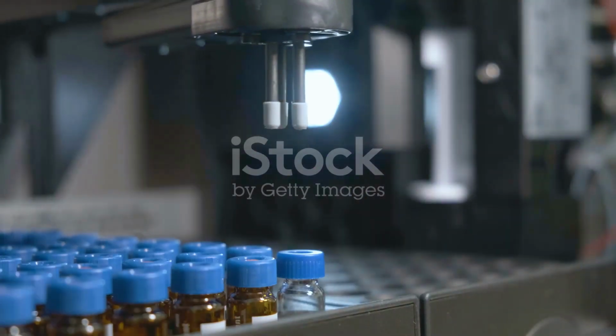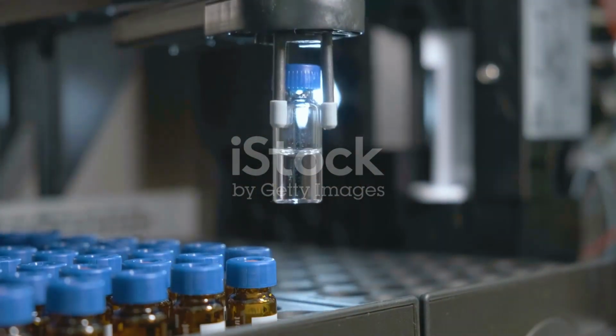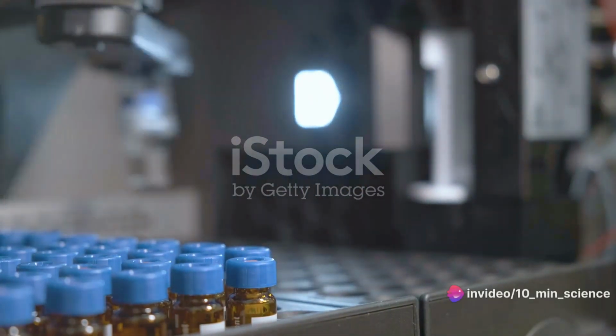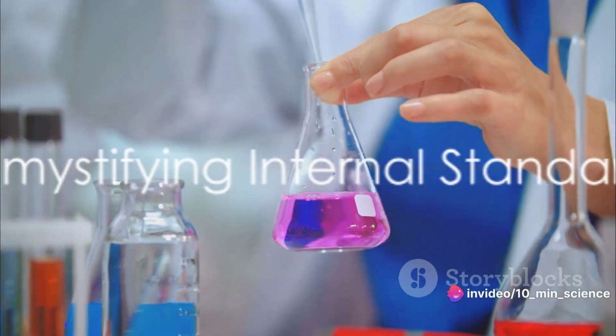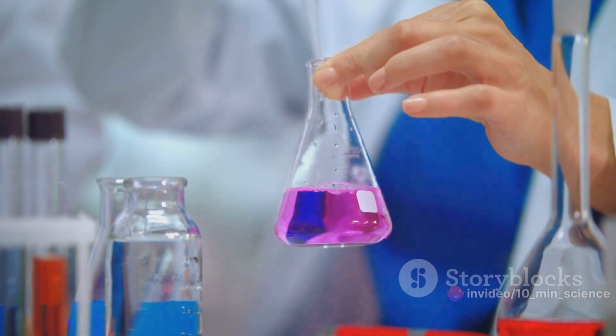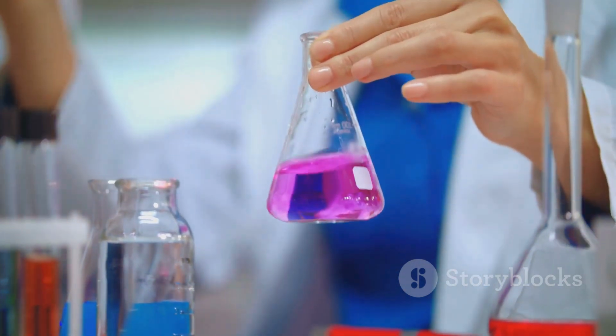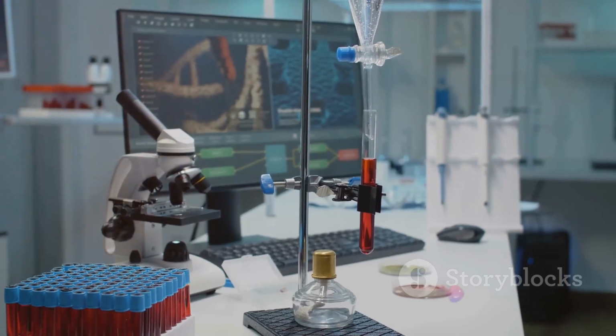Now that we've established the significance of HPLC, let's dive into the intricacies of one of its most crucial aspects, the internal standards. In the world of HPLC, internal standards are like the unsung heroes, working behind the scenes to ensure accuracy and reliability. To begin with, let's understand what an internal standard is.